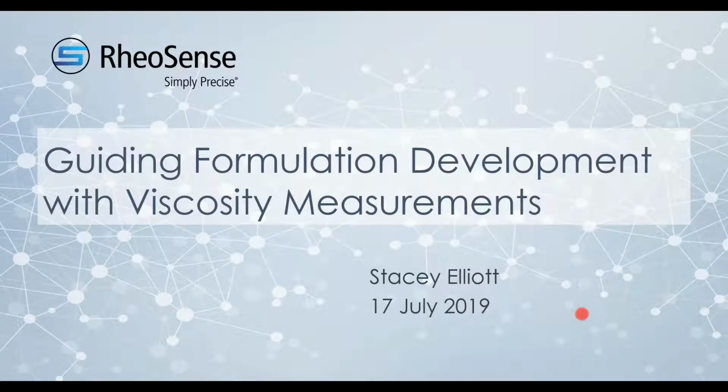As you know from the advertisement, what we're going to talk about today is how you can use viscosity measurements to guide you as you're developing your formulation. And although it's not evident in the title, I think it was evident from the advertisement information that we're really going to focus on proteins today. So the data we're going to share is from model protein solutions.